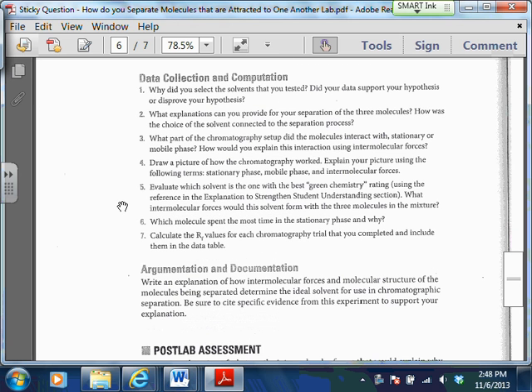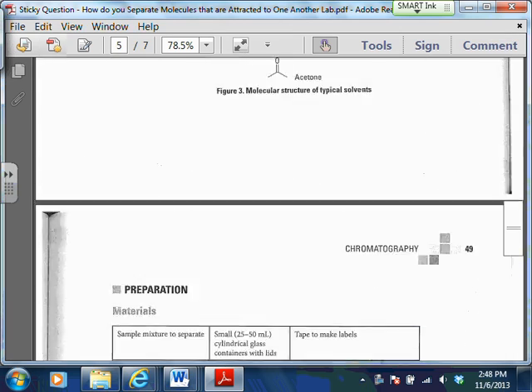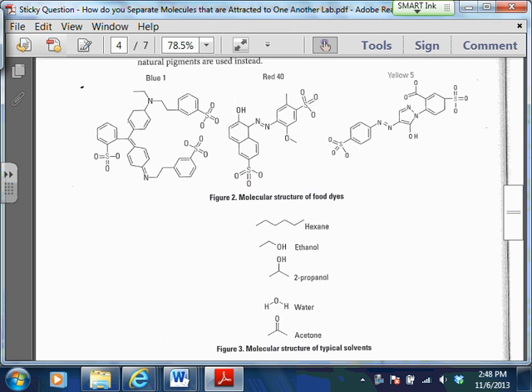What do I need to say about that one? How is the choice of solvent connected to the separation process? Okay. So, because these things are polar, you're going to get better separation if you use a polar solvent, right? That can help to separate them. The hexane, what happened with the hexane, basically, just to use the most extreme case here, this is completely non-polar. There are no OH groups on this. There are no lone pairs of electrons anywhere. I know it doesn't look like it looking at this structure, okay? But this is completely symmetrical, so completely non-polar, all right?